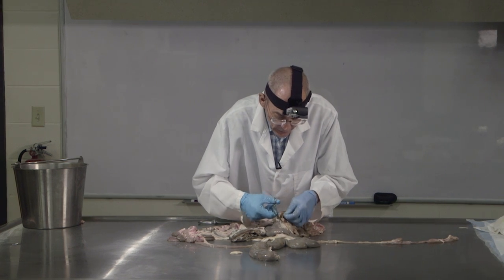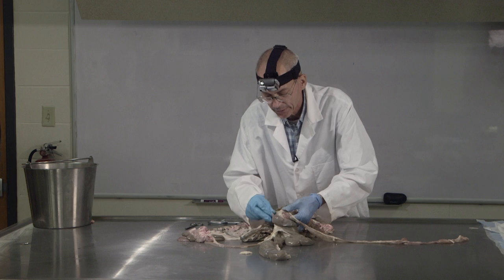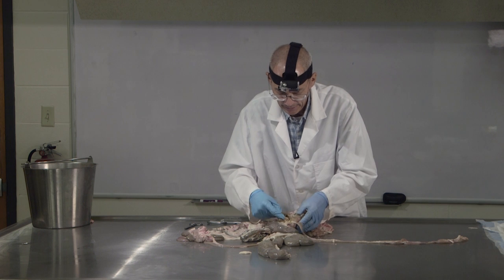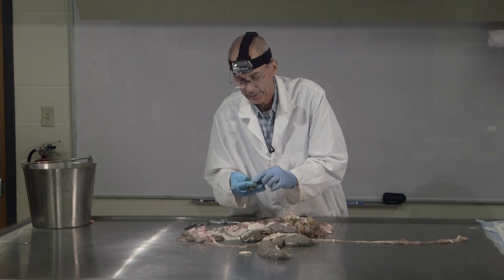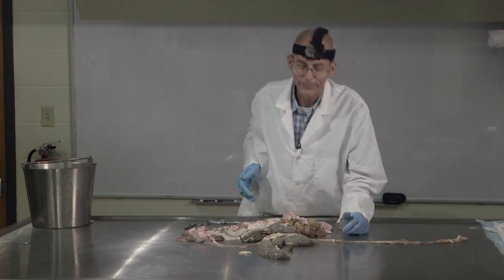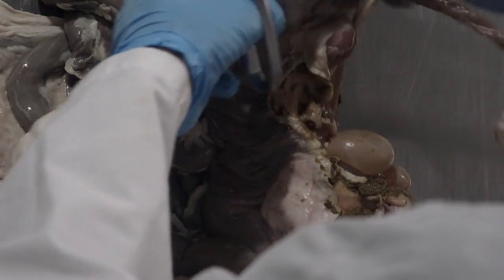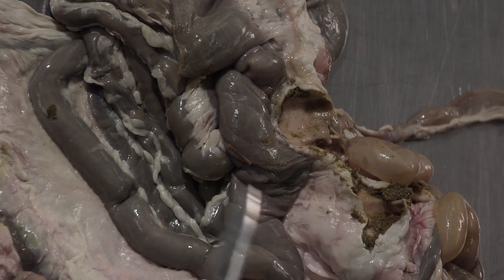Okay, this particular sheep is on a ration that doesn't appear to be really forming pellets very nicely. You know, a lot of sheep, when it's dry, they'll have little fecal pellets, but in this case, it's a little bit more. There's a little sheep pellet. But anyway, that's kind of what the fecal material looks like now.